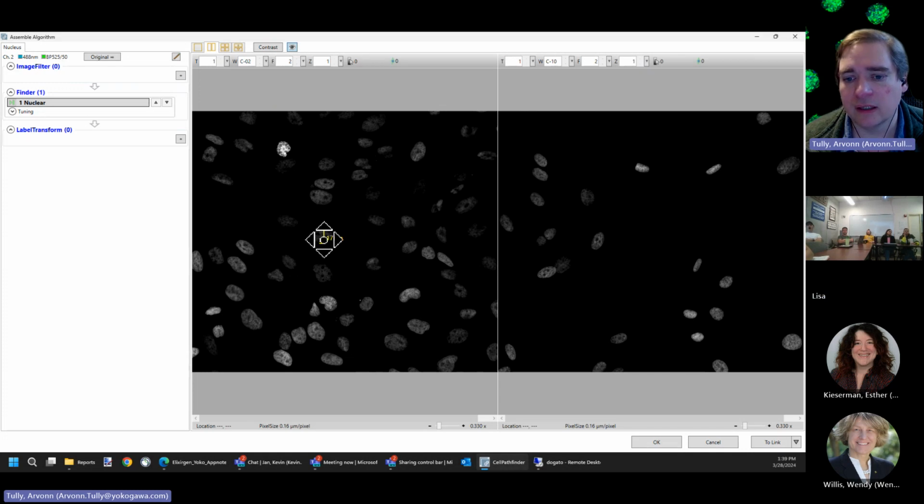a useless sample. And that's why you guys are here. That's why you bought a CQ1, because you realize the N of 1 is a mistake. You need multiple measurements because you shouldn't be publishing anything with only just a few measurements, right?